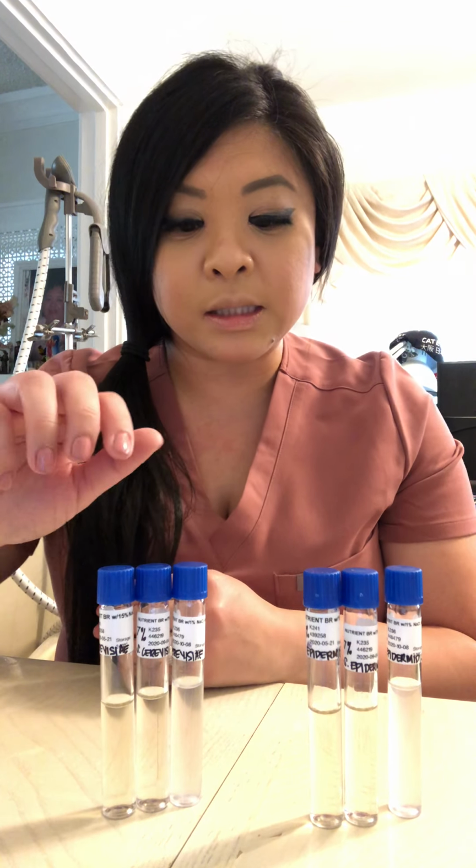So obviously, S. cerevisiae is unable to tolerate highly concentrated salty environments, but at 1% it can. This means that this yeast can grow in low salty environments.